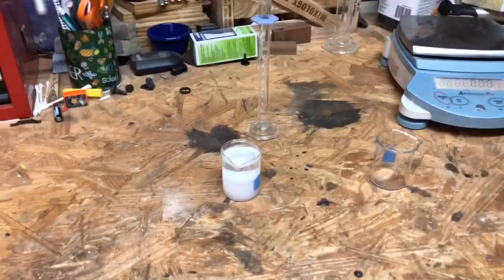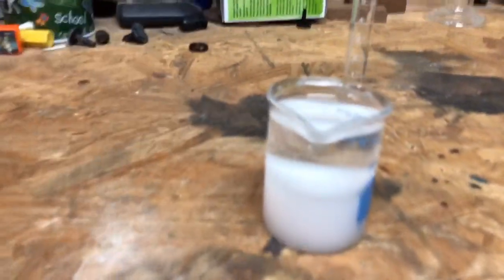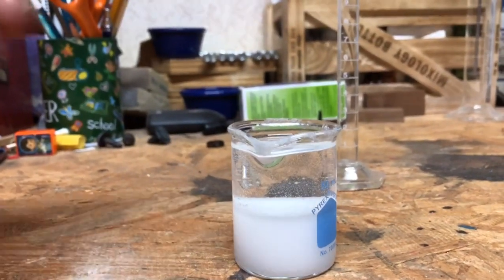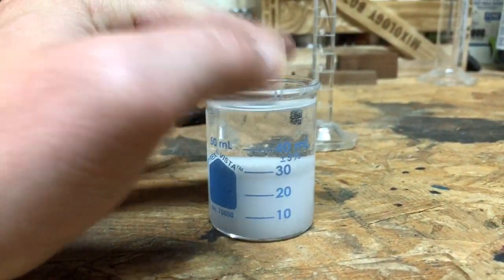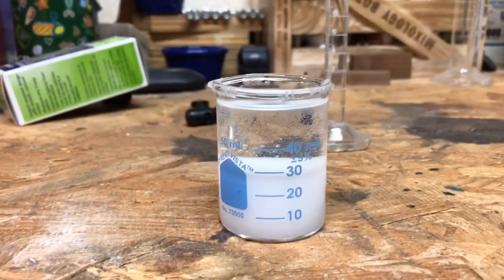Okay, so we went ahead and mixed the salt in. You saw we stirred it like crazy until we got to the point where it was as saturated as possible. And now we have given this some time to sit, and we've allowed all of the solid that will not dissolve to sink to the bottom.